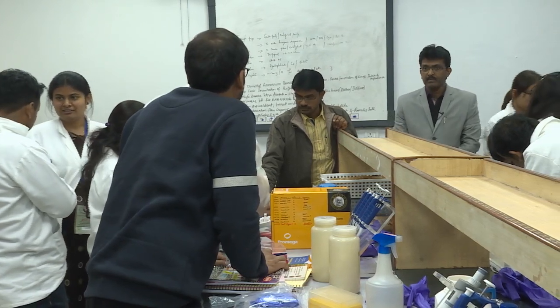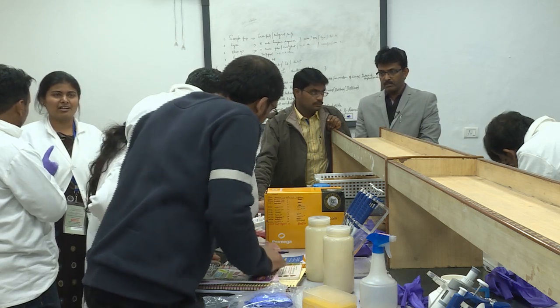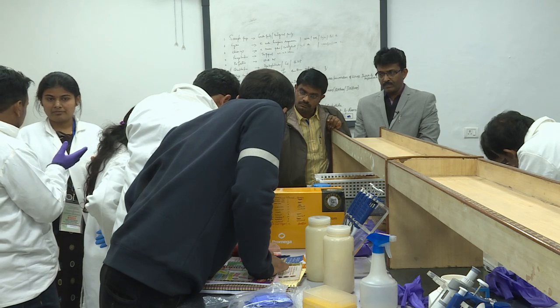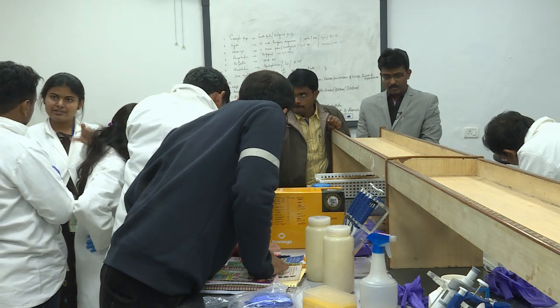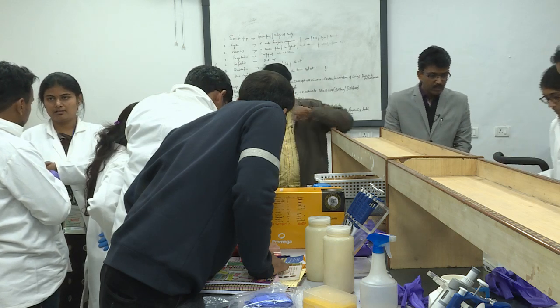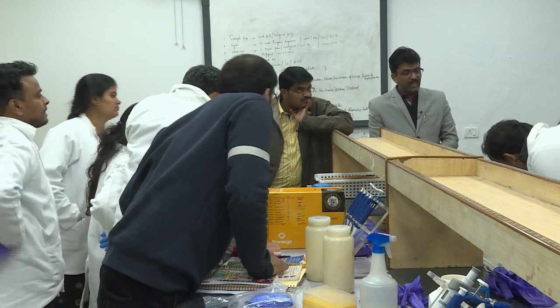Yes, sir. Picomole: what happens, suppose we are getting primer, we have a particular volume of water to make it 100 picomole per microliter concentration. ठीक है, 100 picomole हम बना लेते हैं, then from here we dilute it to 10, ठीक है, 10 times. So you do it for 200, right? Yeah, good. From here, 10 micromole.